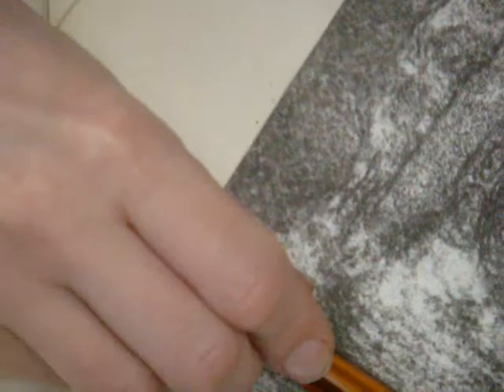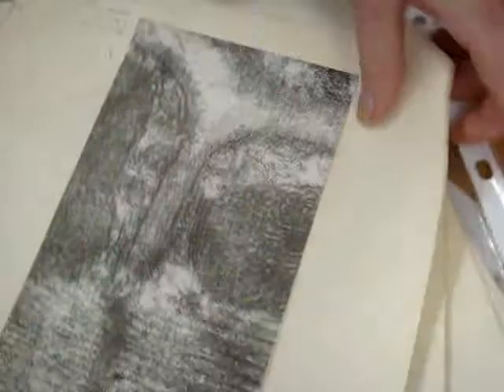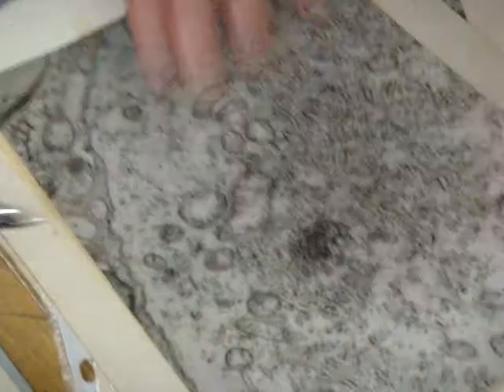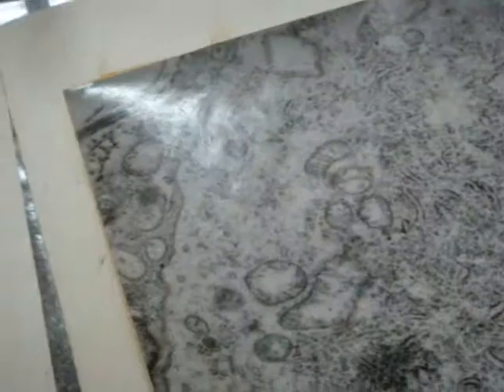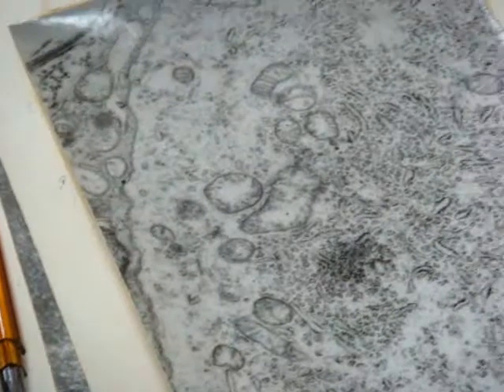Very good. One part of a cell, what is it? Nissl body. So this is part of a neuron, we can see Golgi apparatus and mitochondria here. Very good electron micrographs. This is muscle, tubules opposite the line, cardiac. Again, neuron, yes, Nissl body. And look please, this is a neuron covered by a glial cell. Only after that will be basement membrane and these collagen fibers visible. So this is a glial cell, this is a neuron. These processes come through the body of one cell, or a glial cell comes to this body to form a synapse maybe.